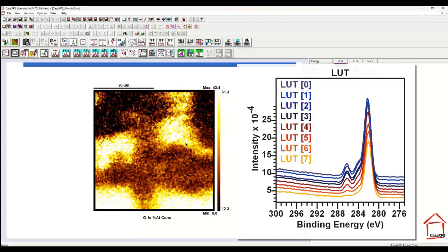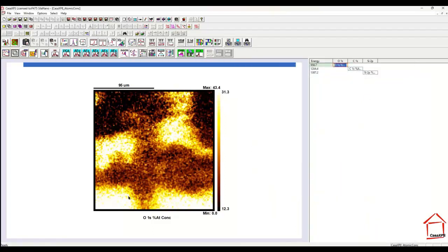So the first job in identifying pixels of a similar intensity is to eliminate some of the artifacts of the measurement process. And that's why I'm looking at, in this file, atomic concentration images. Now they're not strictly atomic concentration images. We can see simply by the fact that we have oxygen highlighted in different areas of this image that we do not have a uniform homogeneous material that we can genuinely calculate atomic concentrations from. So what do I mean by an atomic concentration image?